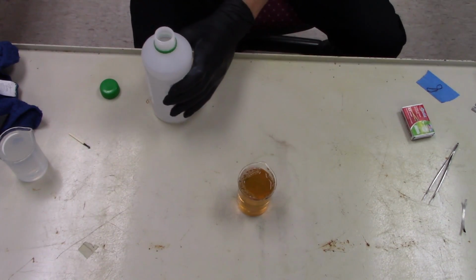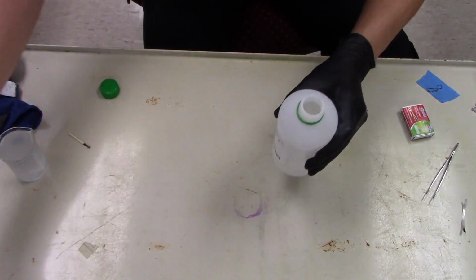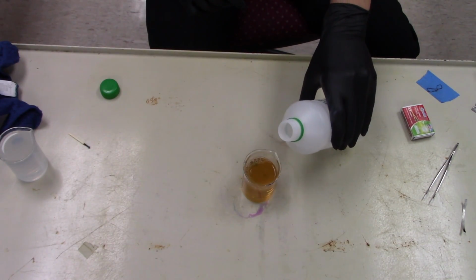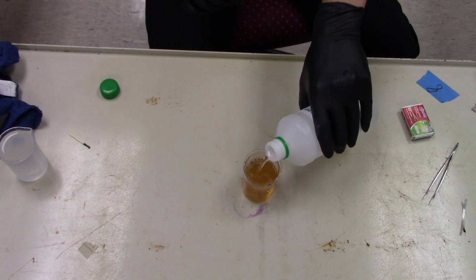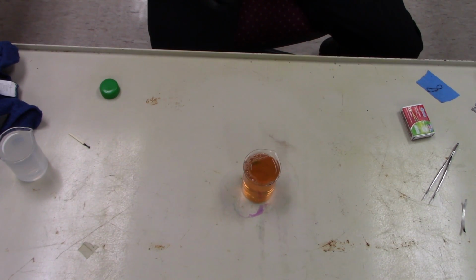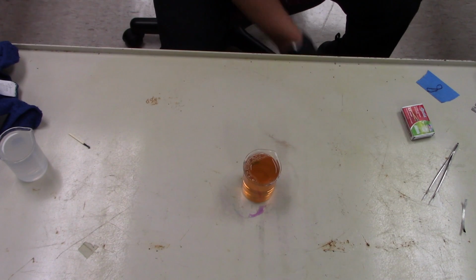But if I go ahead and add a lot more acid to it, let's actually dump a tiny bit of that out. If I add more of this, it should turn like a deep orange because I'm making it more acidic. Not quite. It did last time, but not quite. I had more concentrated bromothymol stuff. So that is a chemical change.